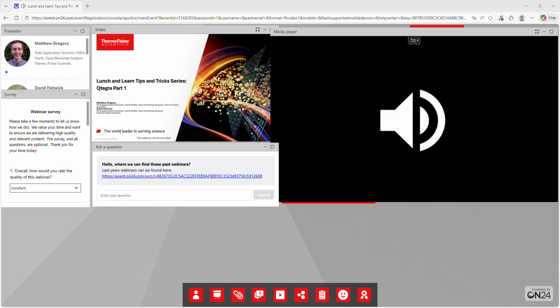One time we would absolutely have to do the tunings is if we did any maintenance. So if we're taking the system apart, cleaning the cones, cleaning the sample introduction system, then yes, definitely we'd do some tuning, but we don't necessarily have to do it outside of that. We'll talk a bit more about tuning and interpreting performance reports and when and why we might do tuning in the next webinar, actually. So if you tune back into that, you'll get a bit more information there.